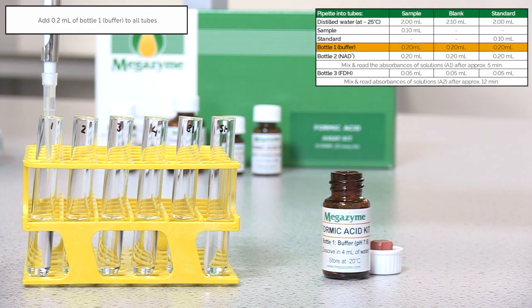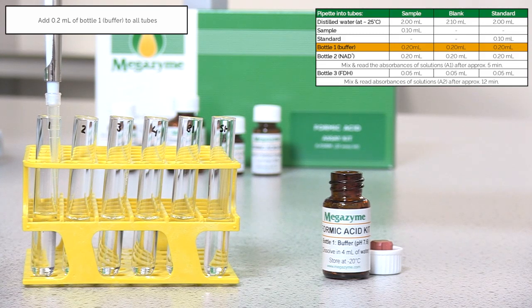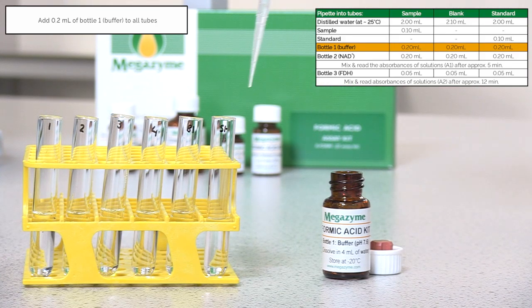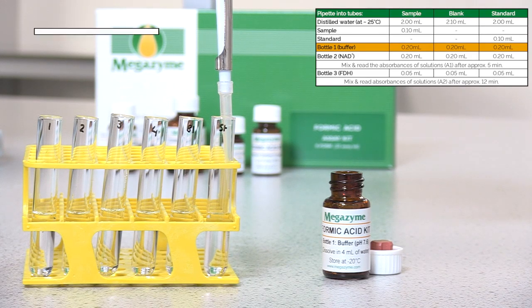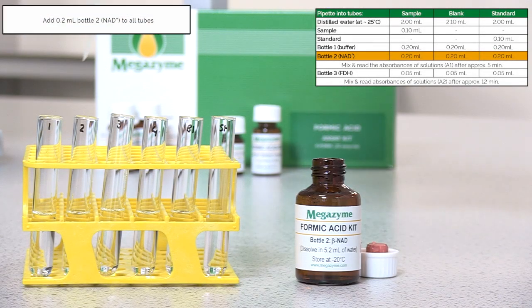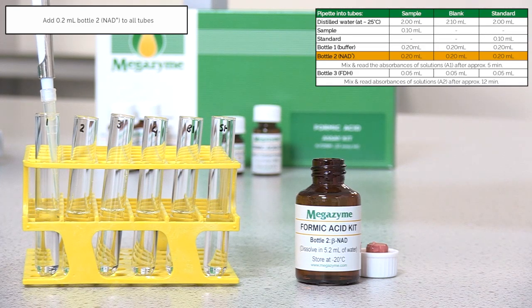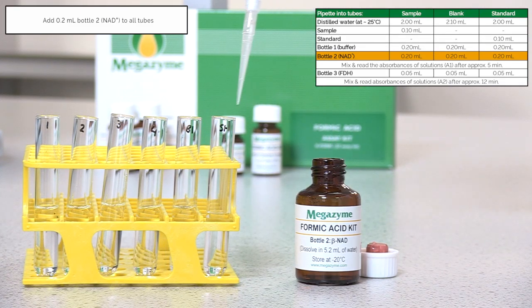Pipette 0.2 ml of bottle 1 buffer into all assay tubes. Pipette 0.2 ml of bottle 2 NAD plus into all assay tubes.